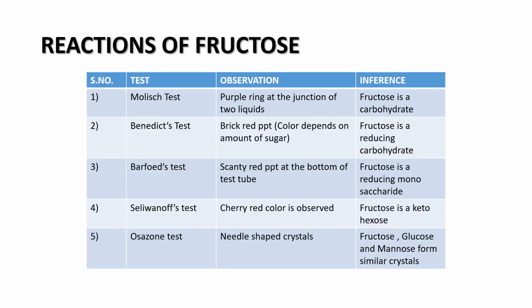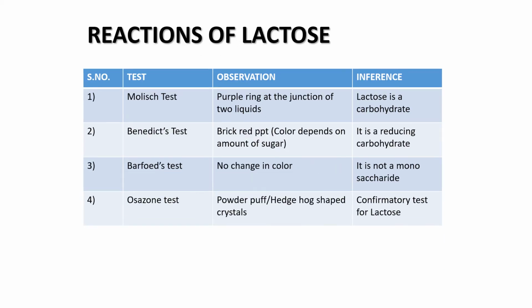Now this is the summary for the observations and inferences for the reactions of fructose. And here is a summary for the reactions of lactose. If you will notice, there is no Seliwanoff's test for lactose. If we were to do a Seliwanoff's test for lactose, we would expect no reaction, or no formation of a cherry red color, because lactose is not a ketohexose and it is a disaccharide.